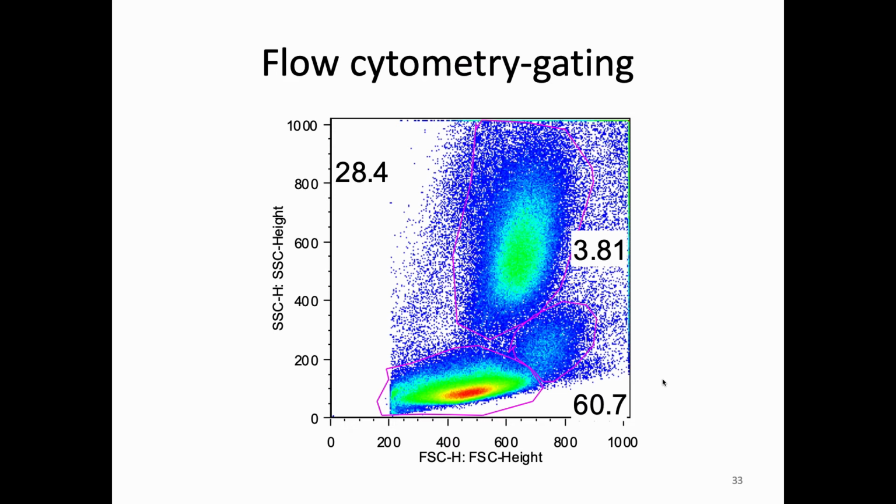This plot is a very standard plot of blood. You can see that these cells have kind of small-ish size. They're also really not granular. They're relatively small on the forward scatter axis, at least compared to these other two. They're way at the bottom of the granularity axis. And cells with that profile are lymphocytes. So those are my lymphocytes, and I had 60% lymphocytes. These cells that have big size, medium-ish granularity, those are the monocytes. And all these cells that are super granular are the granulocytes. And so, again, you can think about how challenging and how long it took you to do that in the lab. This is done almost automatically by this. Yeah, I had to draw the gates, but I've done it enough times that it doesn't really take much work.